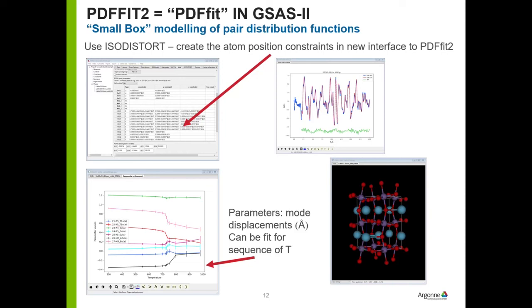One of the things you can see here is that as you increase the temperature, there's a change in the symmetry, and a couple of the modes become degenerate because of that change. You can actually see them match up here and also here. So instead of having 1, 2, 3, 4, 5, 6, 7 modes, you reduce to 1, 2, 3, 4, 5 modes because of the change in symmetry. You can actually see the transition right here. In each case, you can draw the structure out, and GSAS II has a way of stepping through the temperature, so you can see the structure change as a function of temperature right in front of your eyes. I don't show that as a movie.